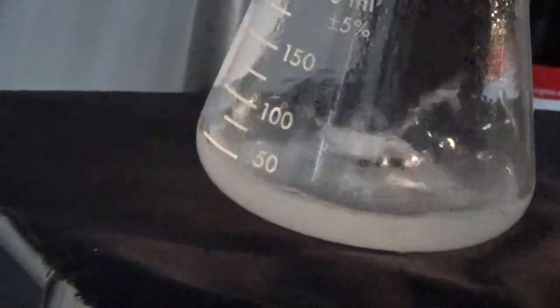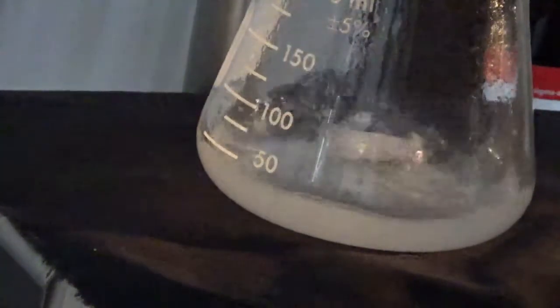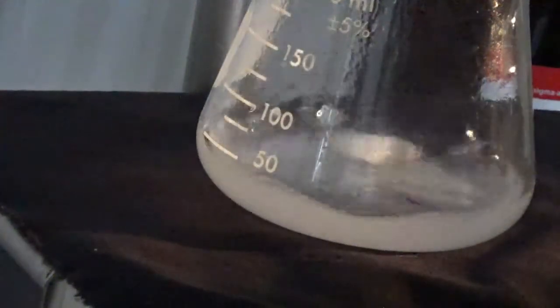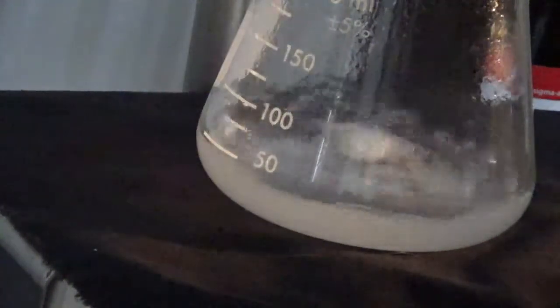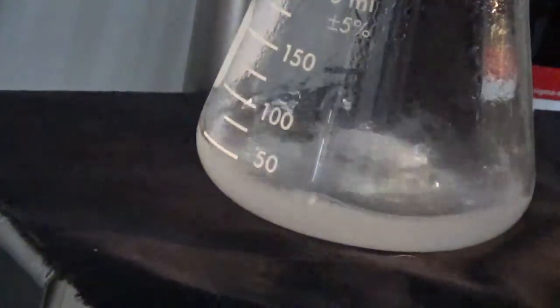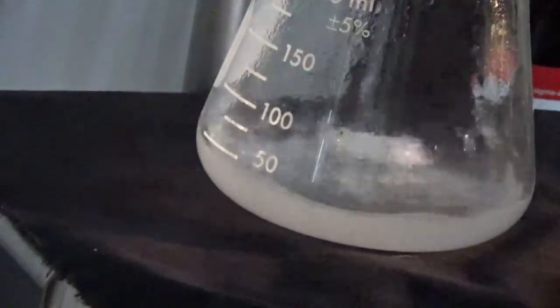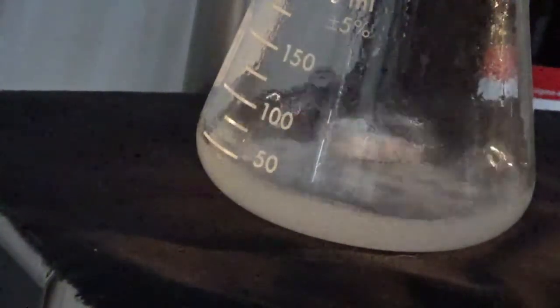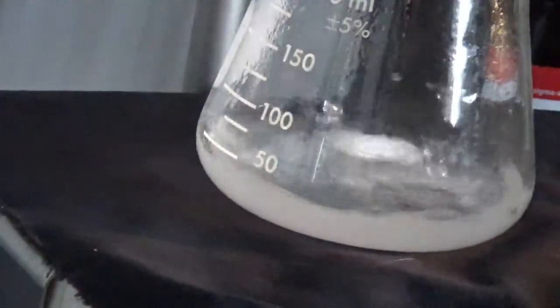And so what we're looking for is for this cloudiness to become clear. That's the turbid point. And I've heard that the first one for this experiment is a little difficult to see. So we'll see. It still looks cloudy to me. Of course, not very much has dripped in. Drop. I don't even know if you can see it. Another drop. Drop, drop, drop. I'll put 5 of them and I'll stop it. That is still cloudy.